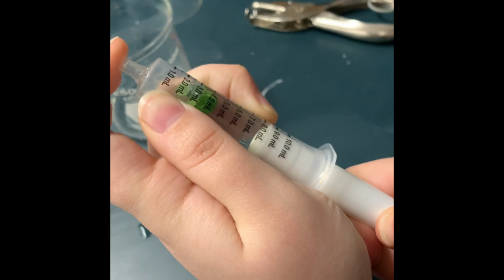First, you should push the plunger, removing as much air as possible from the syringe. Then, you will hold a finger over the syringe opening and draw back on the plunger to create a vacuum simultaneously. Hold this for 10 seconds and swirl the syringe so you can get all of the leaf discs suspended in the solution.